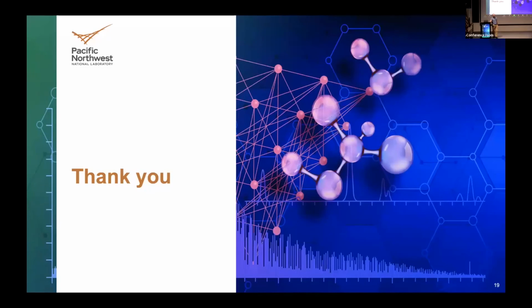But generally speaking, outside of this particular application, if you're able to put your data into an open mass spec format, even with some of the work we've done here, you can quickly develop tools that are tailored to your own workflows pretty easily.